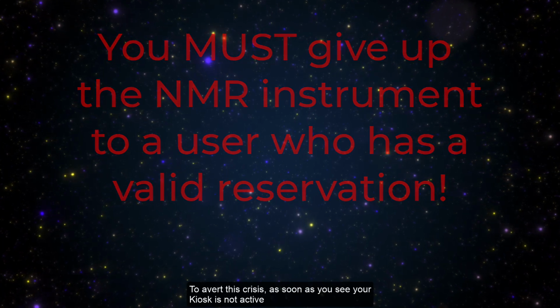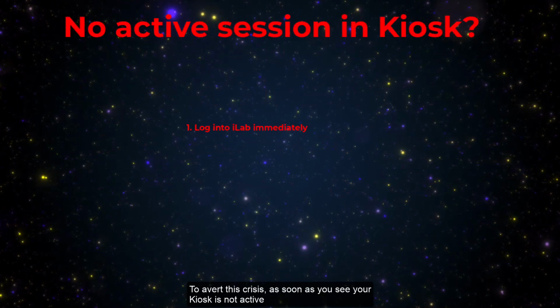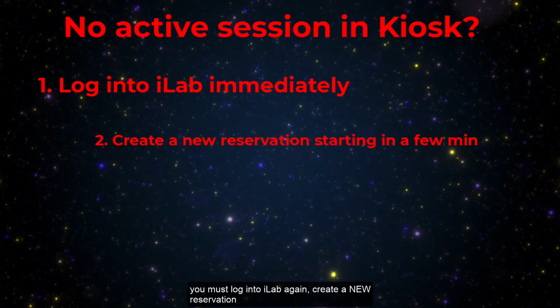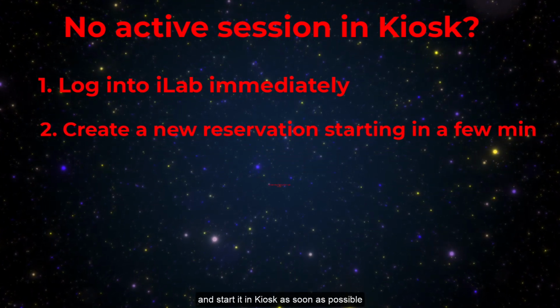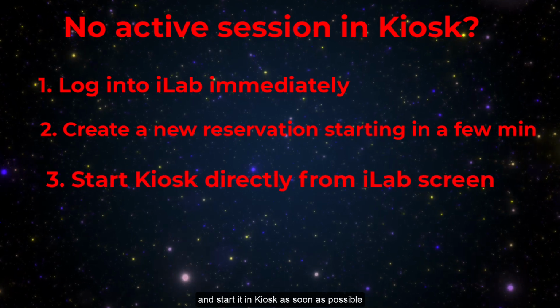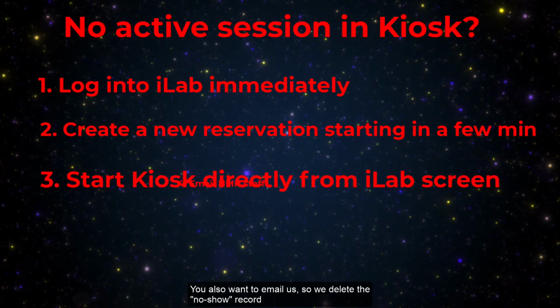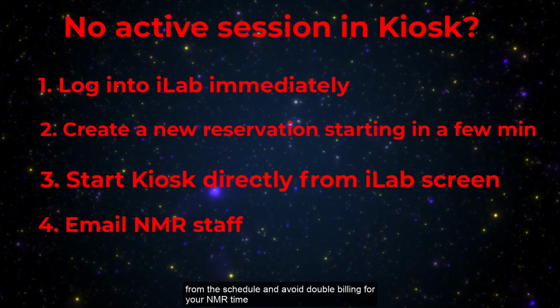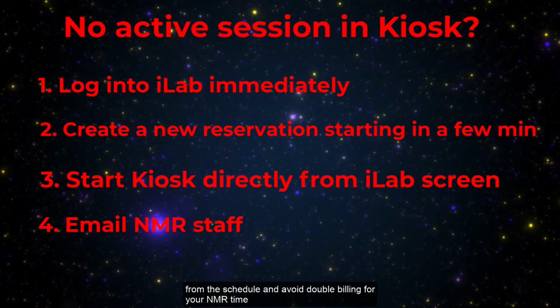To avoid such a crisis, as soon as you see your Kiosk not active, you must log into iLab again, create a new reservation, and start it in Kiosk as soon as possible. You also want to email us, so we delete the no-show record from the schedule and avoid double billing for your NMR time.